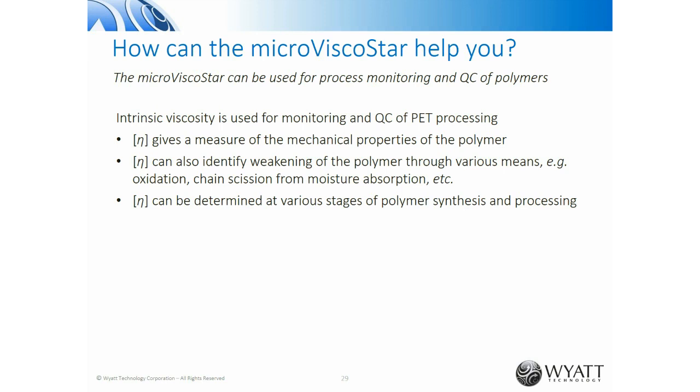It's also very useful because you can do it quite easily at various stages of polymer processing. You can do it when you receive the batch polymer from a supplier. You can do it after you do melt processing. You can do it after you process it into whatever component that you're making.